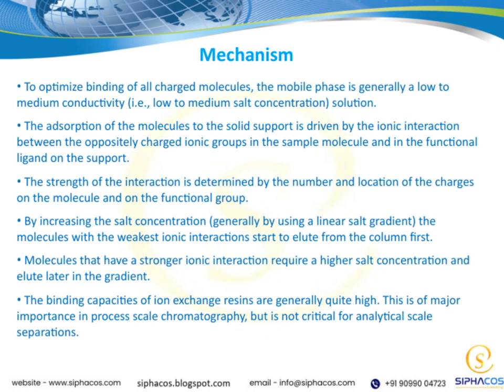Specifically, the charged groups on the molecules interact with functional groups on the resin or support material. Think of it as a kind of molecular handshake based on opposite charges. Now, the strength of this interaction depends on how many charges are present and their positions on the molecule, as well as on the functional groups on the support. More charges or certain arrangements can make the binding much stronger.